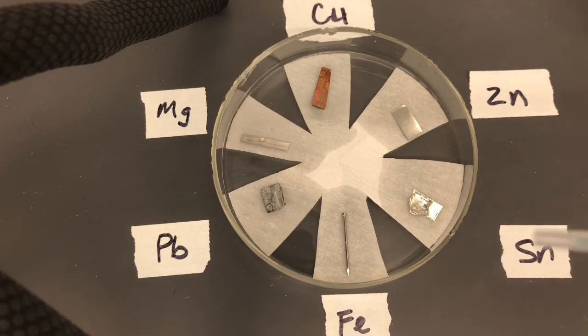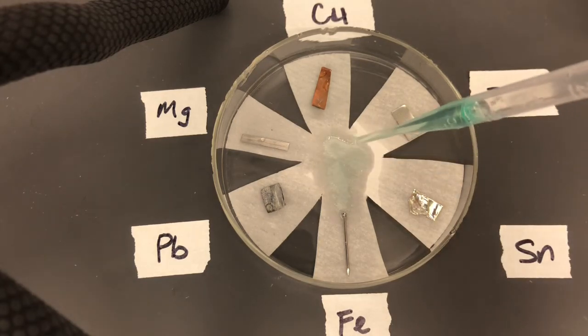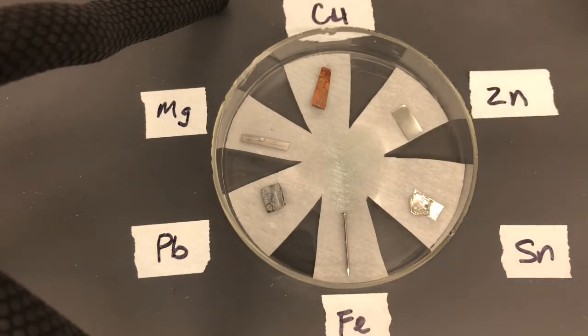concepts we want. In the middle of all of these solutions, I'm going to add a saturated solution of potassium chloride. Potassium chloride is meant to be our salt bridge. A salt bridge enables you to balance out charges as electrons are moving from an anode to a cathode.